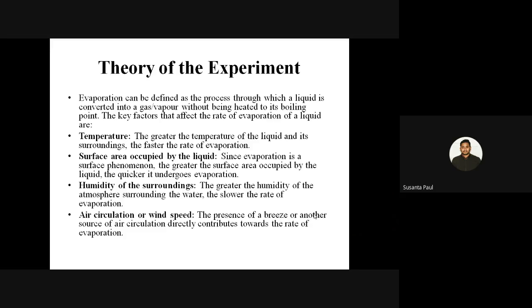So now the next factor is the type of product required. The selection of the method and the apparatus to be used for the evaporation depends on the type of product required. Just to give one example, the open pan will produce the liquid or the dry concentrate, while the film evaporator will yield the liquid concentrate, which you have already studied in the theory part. Now the density: as the density increases, the rate of evaporation will decrease.